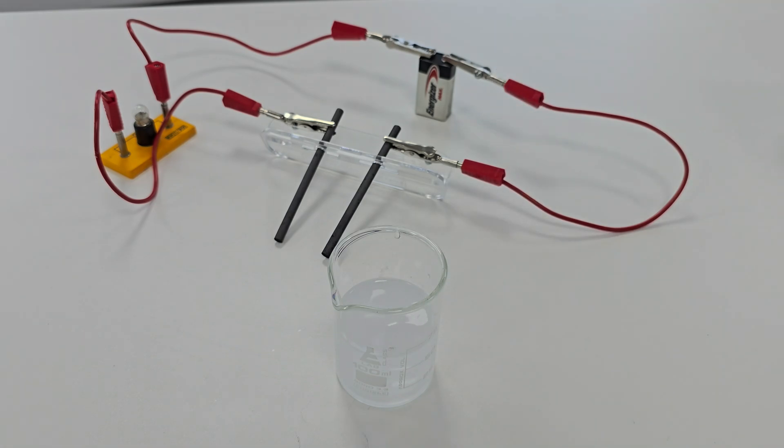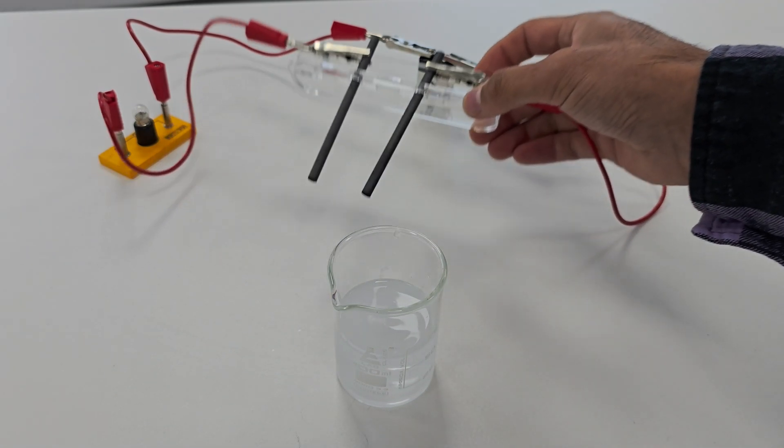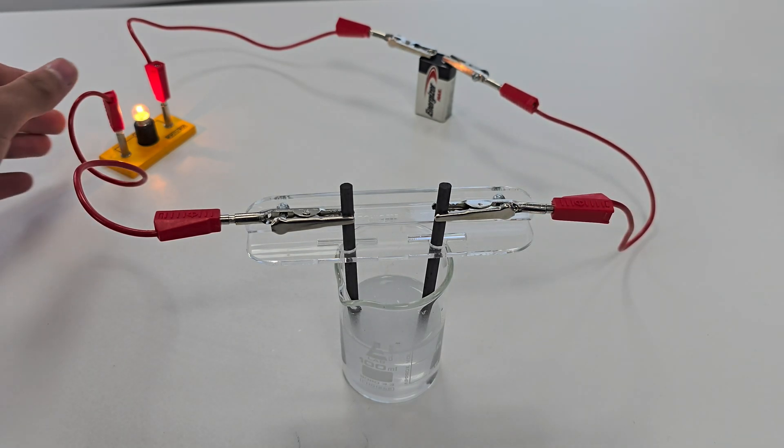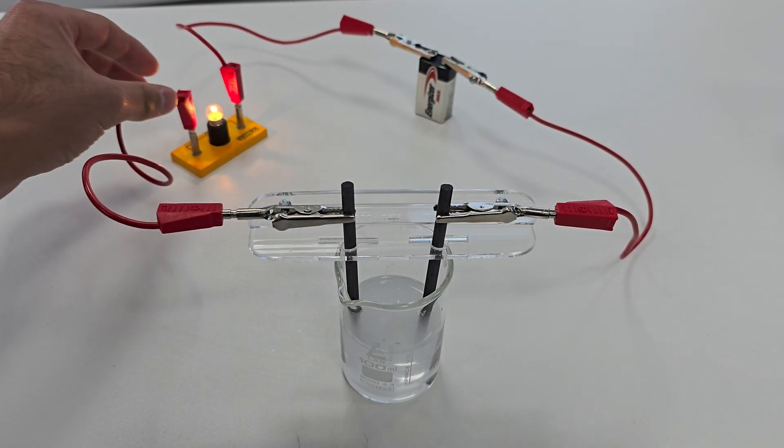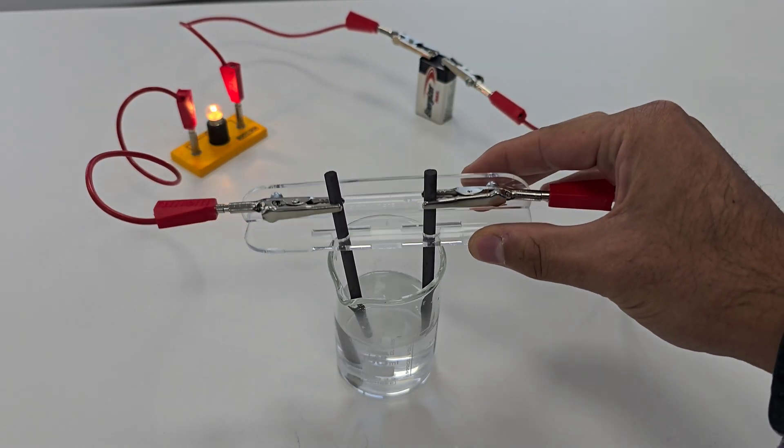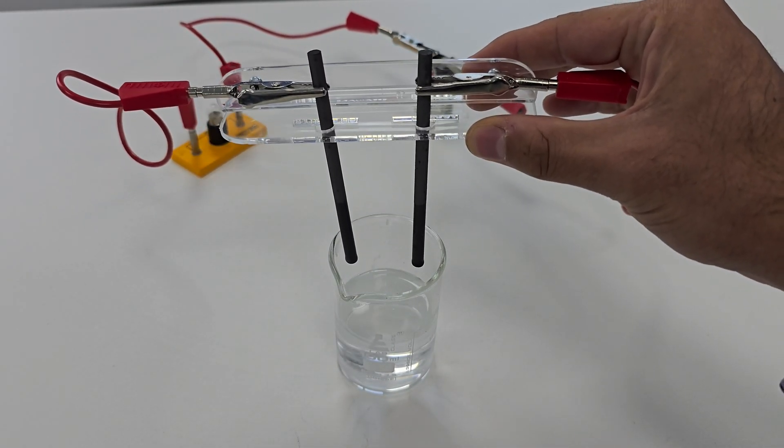Let's test the solution. As I lower the electrodes into the liquid, the bulb lights up. This shows that the solution conducts electricity. Watch as I lift the electrodes out and put them back in. The bulb goes on and off. The electrical conductivity depends on the presence of the free ions in the solution.